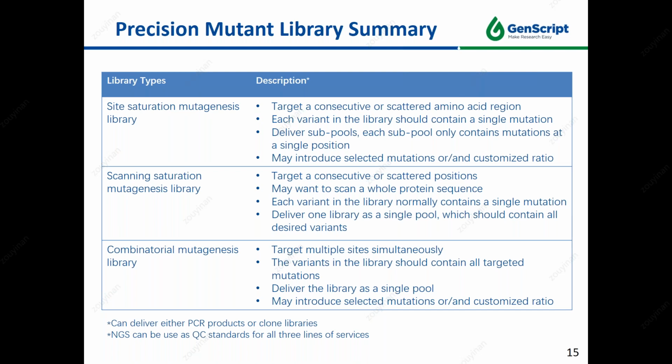For all these three types of service, the NGS method can be applied to verify the distribution as well as the coverage in all three types of libraries.